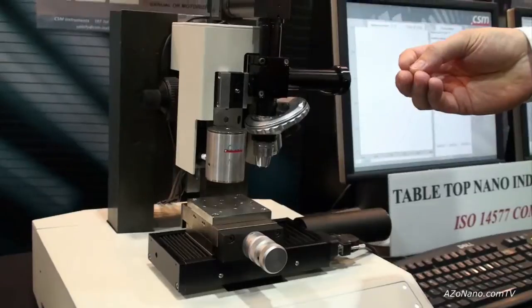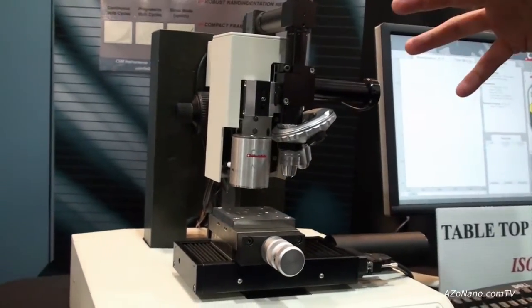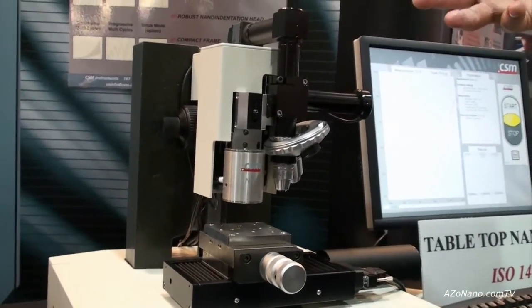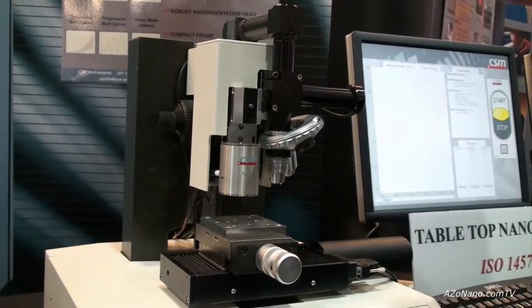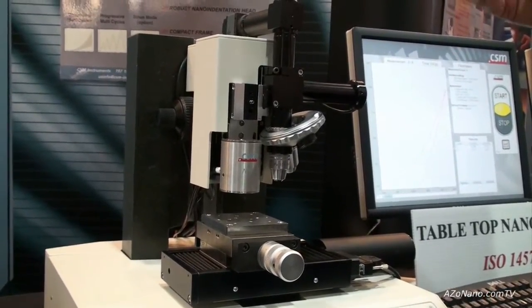What is specific to this machine is that we've taken all of the know-how from our commercial grade machines and we've made a simplified desktop nano indenter. Now, what does that mean? It means simplicity.